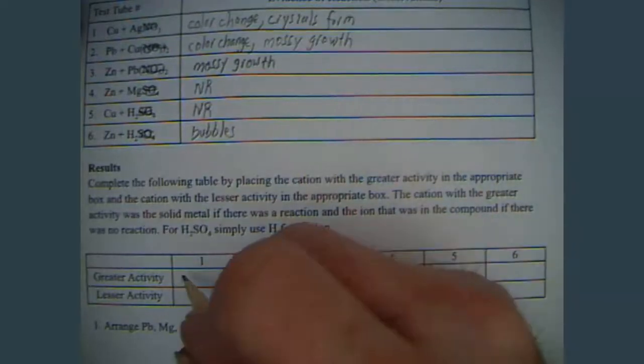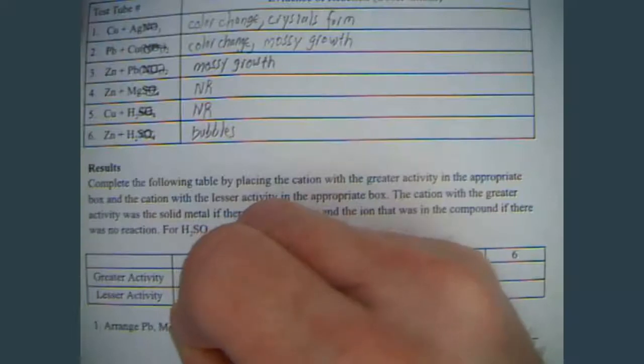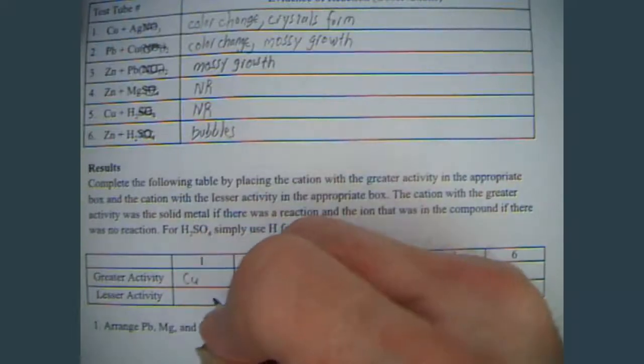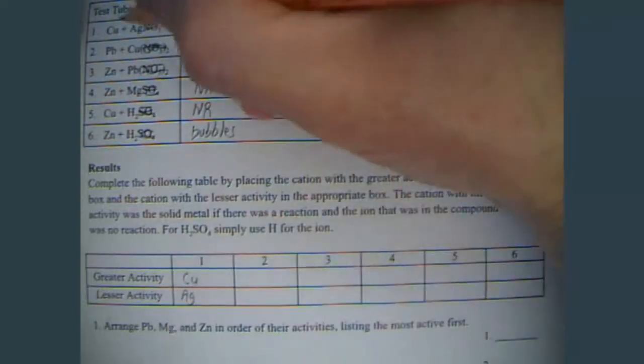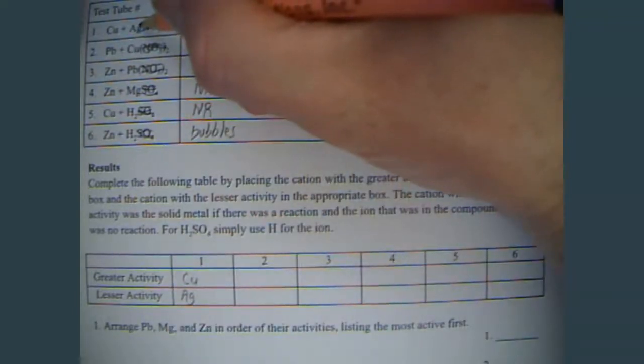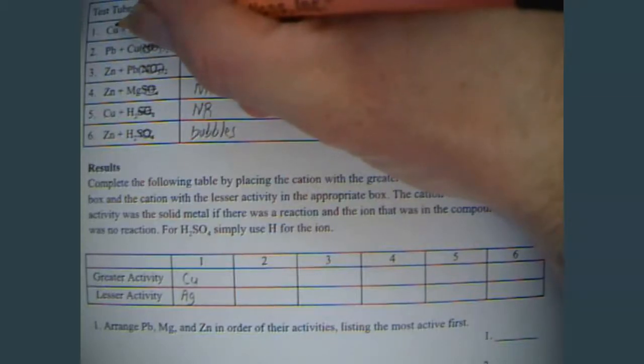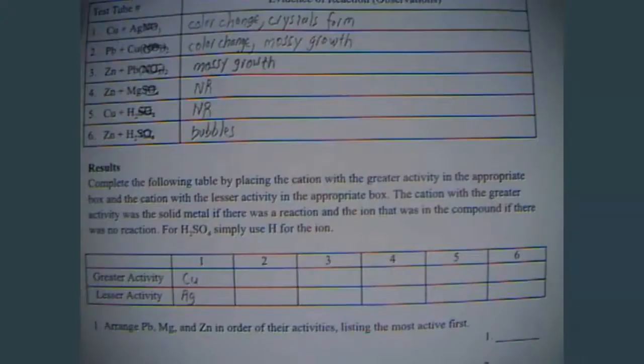So, the greater activity then down here is going to be copper. And then the lesser activity was the silver. Because, the copper was able to come over, kick the silver out of the solution and take its place. So, that shiny stuff that's growing on the copper is actually silver powder.